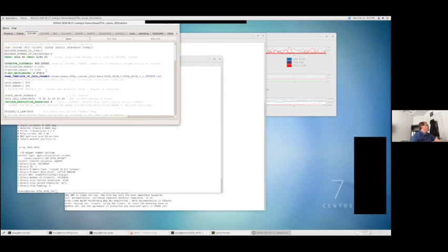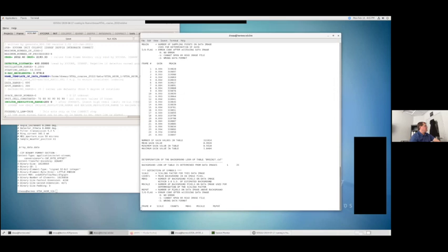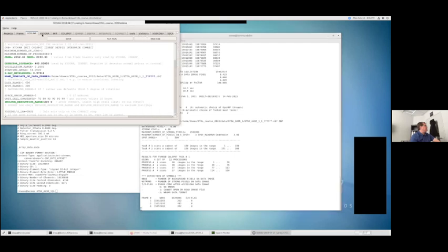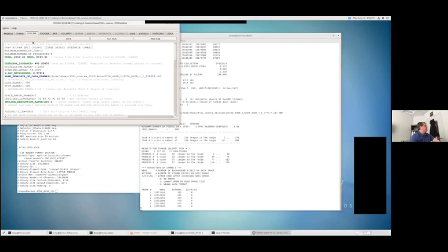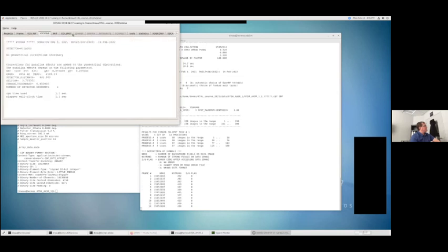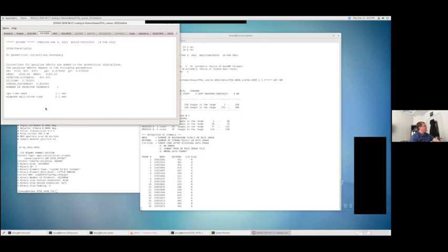Okay. So we made our adjustments to XDS. We're going to save it, and now the run XDS becomes active. I'm going to click run XDS. And you can see over here in the background, it's updating stuff on this screen. That's just running the normal output that you would get from XDS. And as it completes each step from the job, it highlights these tabs so they go from grayed out to black, and you can look at the various tabs to see what's in the log file.